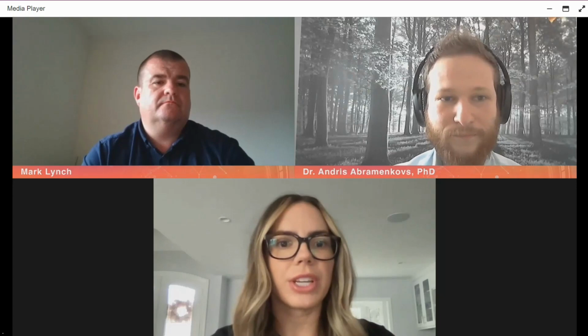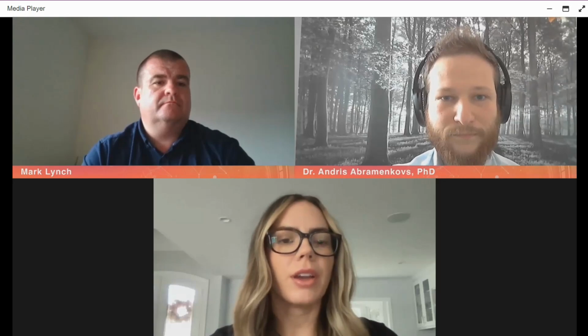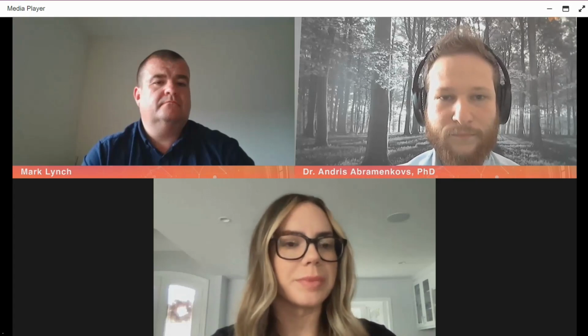Perfect. Thank you so much, Andris. Our next set of questions here is for Mark. First question, how does the CellCelector help the BioScribe workflows?